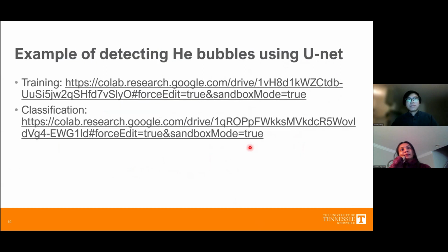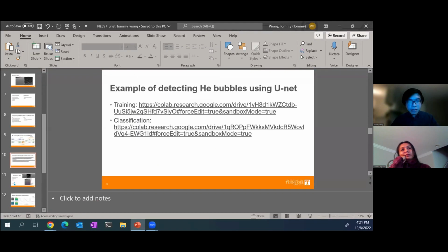So here is an example of detecting helium bubbles using UNet. So I'm going to quit the presentation and go to the code.